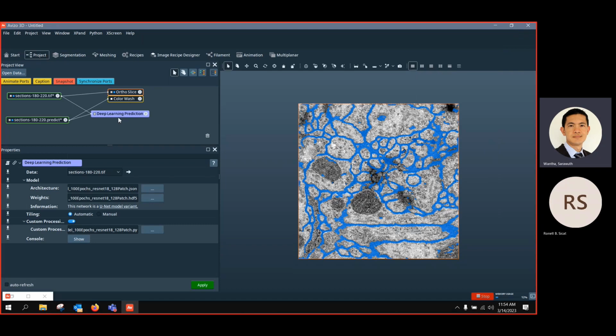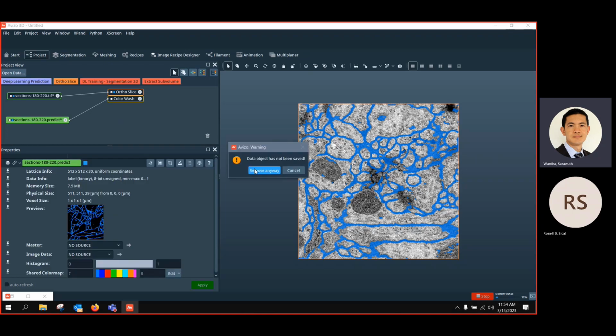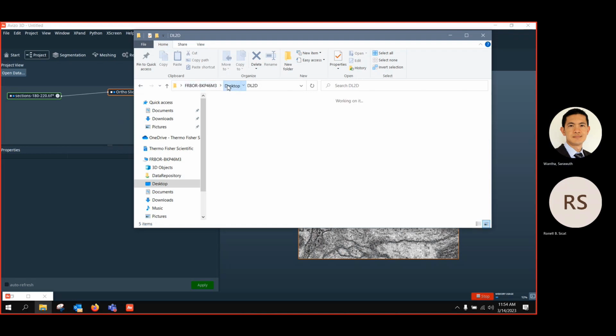Okay. And now I will continue with the training, the same thing, but I will just increase the number of classes. So let's go to this folder again.